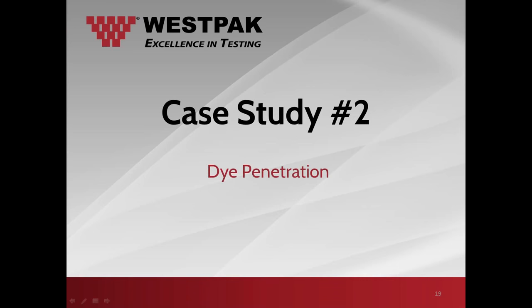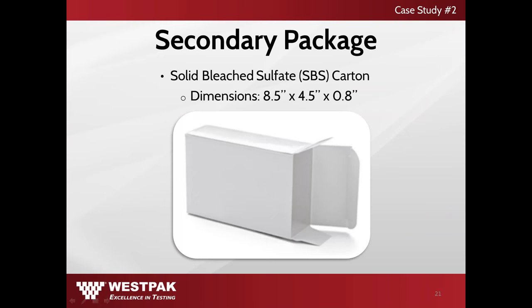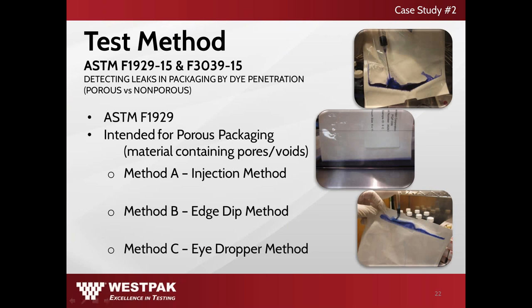We'll now be covering our second case study: dye penetration testing. In this case study, our product will be a glass file packaged in a thermoform tray with a Tyvek lid stock. The dimensions of this primary package are eight inches by four inches by half an inch. The thermoform tray is packed in an SBS carton, also known as its secondary package, with dimensions of eight and a half inches by four and a half inches by 0.8 inches. The two test methods we will cover for detecting leaks by dye penetration follow ASTM standard F1929 and F3039, both revision 2015.